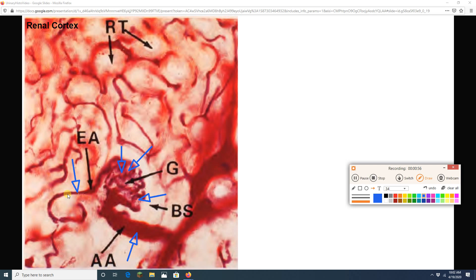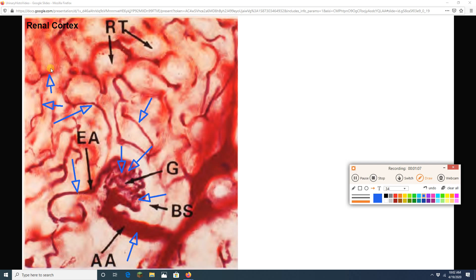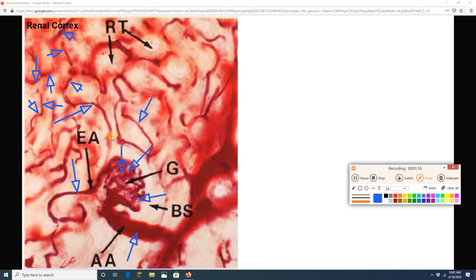From my efferent arterioles, we are going to see lots of its branches. So all of these guys are peritubular capillaries, capillaries surrounding the proximal and distal convoluted tubules, capillaries where we're going to be reabsorbing good stuff from the filtrate and secreting bad stuff into it.